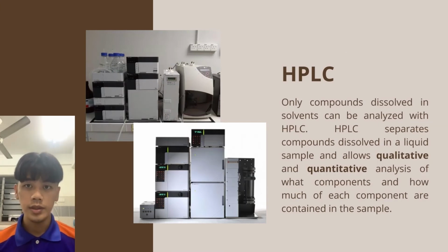A little bit of background about HPLC. Only compounds dissolved in solvent can be analyzed with HPLC. HPLC separates compounds dissolved in a liquid sample and allows qualitative and quantitative analysis of what components, and how much of each component, are contained in the sample.